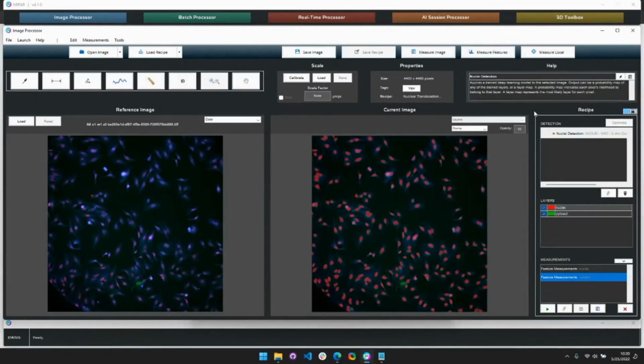You're also free to explore putting together more complex assays, right? You're no longer bound to hoping that the out-of-the-box assay that you receive will come with some image analysis solution, or hoping that somebody else has created a solution for you. With MIPAR, you're able to readily put these solutions together in a matter of minutes and execute them on your entire data set to explore your hypothesis.